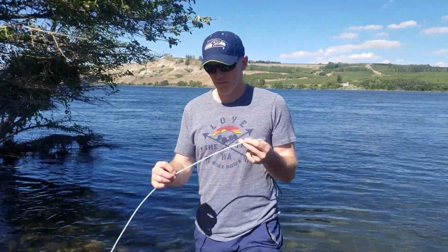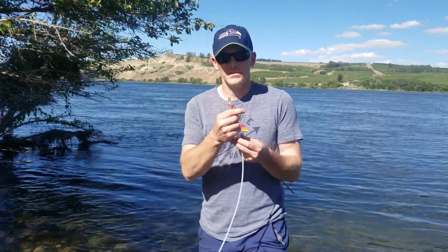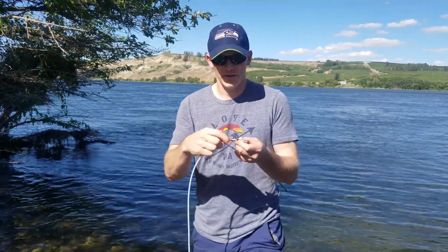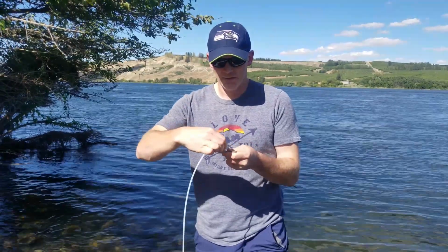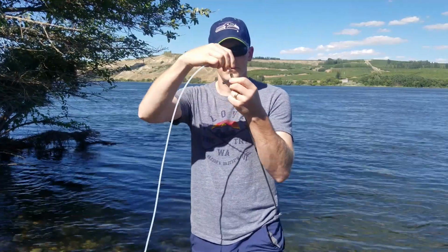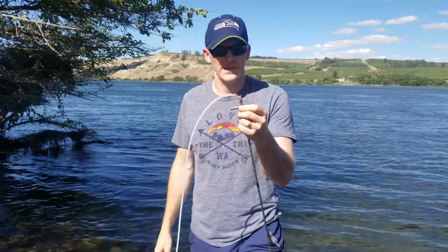The tubing here, the white tubing, is what will be used to pull the sample from the push point into your syringe. The soft tubing at the tip is what's used to connect onto the push point. This will be installed into the ground. You'll take the soft tubing and work it over the top of the push point and work it down so that the white tubing is as close as possible to the top of the push point. And then you'll zip tie right here to get a good connection to seal off.